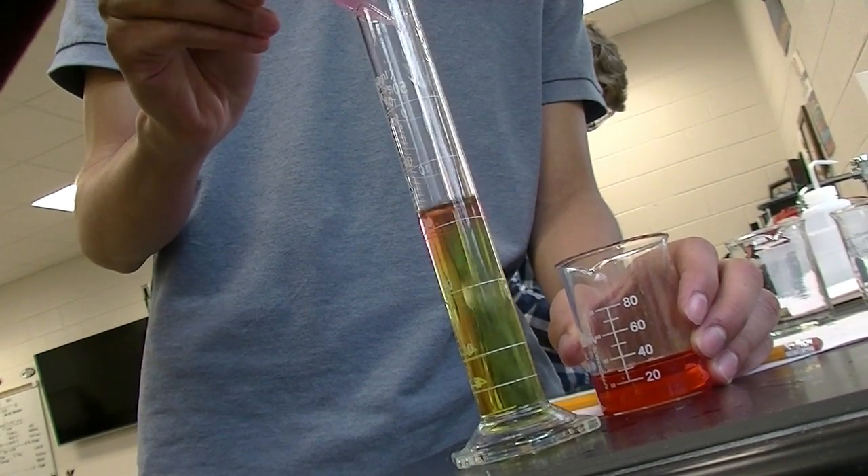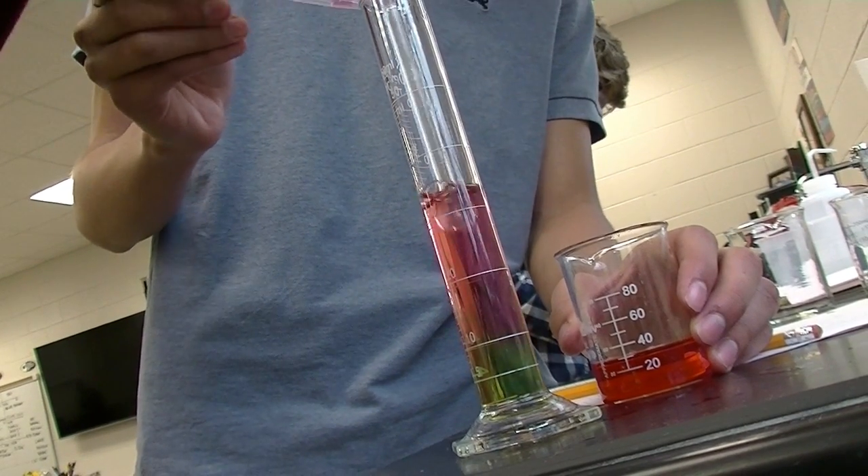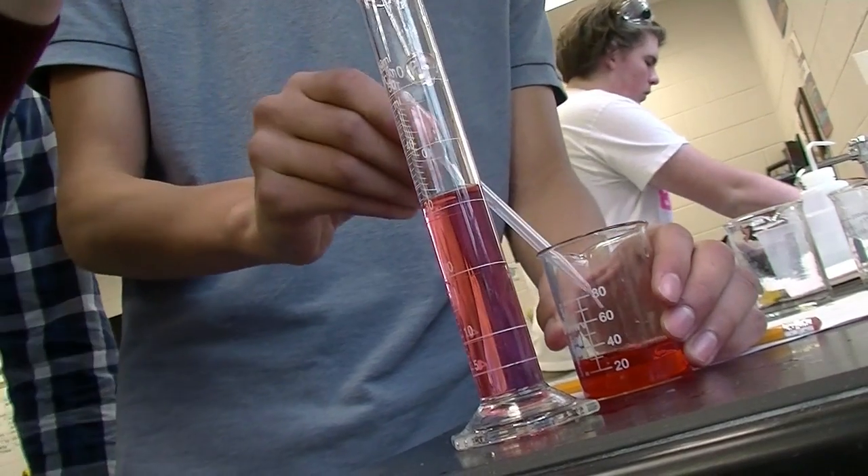I'm going to put all of that in. It seems like it's wet. It's getting darker. Look at the bottom — it's too acidic. Oh my god, it's too acidic.